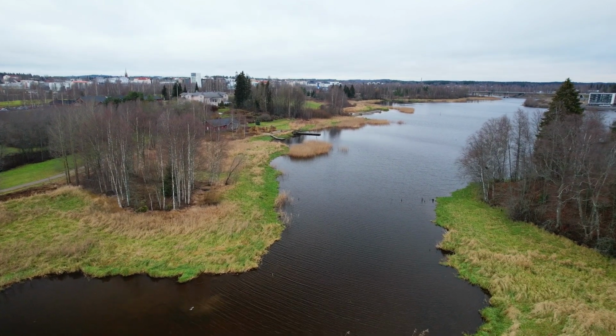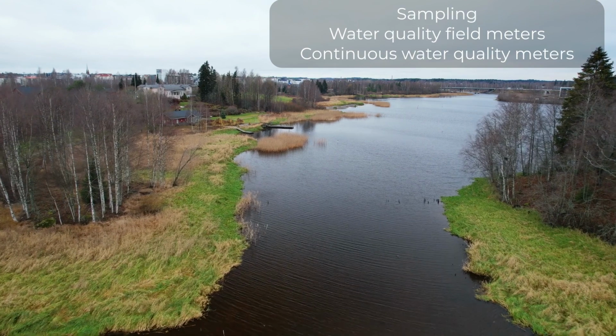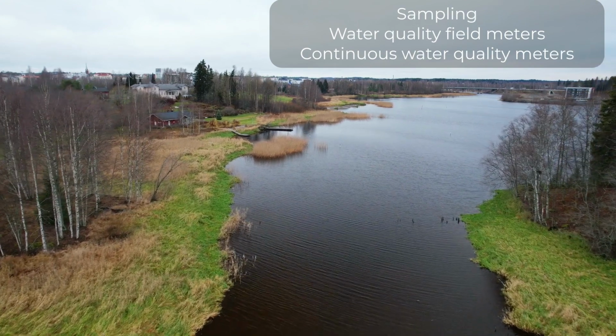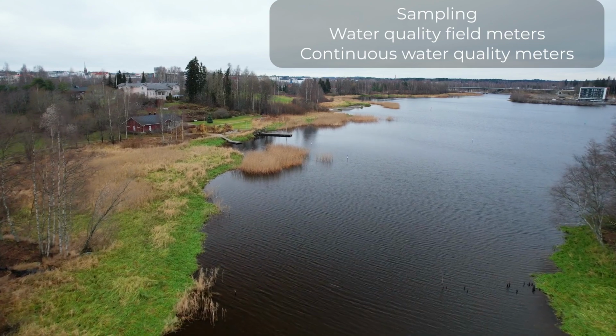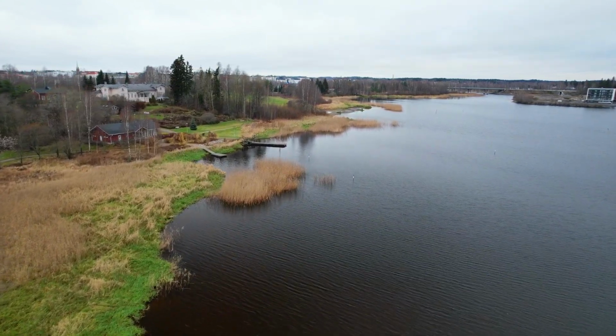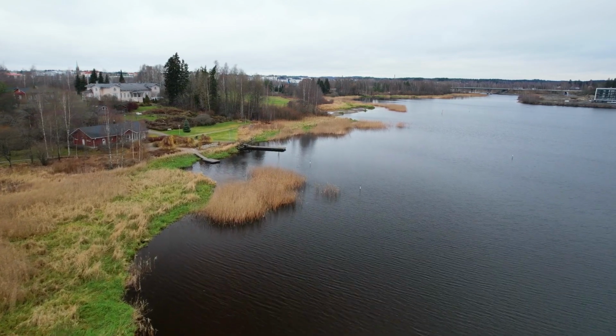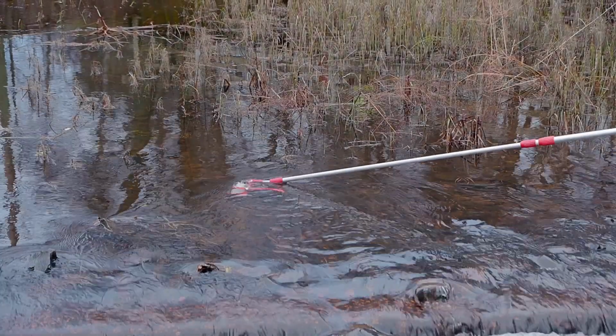There are various methods for studying the state of water bodies. This video looks at 3 methods: sampling, water quality field meters, and continuous water quality meters. The suitable method and analysis should always be selected based on the aims and resources. However, one method does not rule out the others, but they should be used together to support and verify each other. Sampling is the most typical way of studying the state of natural waters.